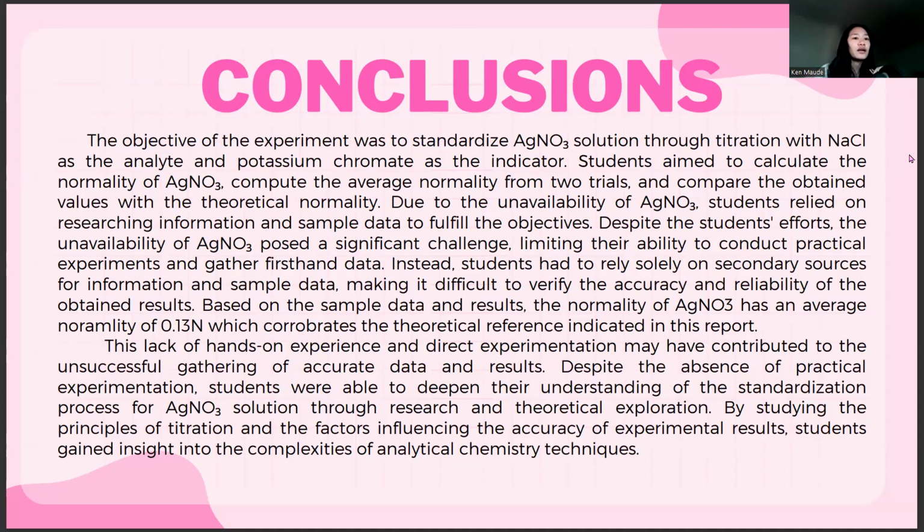This lack of direct experimentation may have contributed to the unsuccessful gathering of accurate data and results. Despite the absence of practical experimentation, students were able to learn about the standardization of silver nitrate solution through research and theoretical exploration. By studying titration and factors influencing the accuracy of results, students gained insight into the complexities of analytical chemistry techniques.